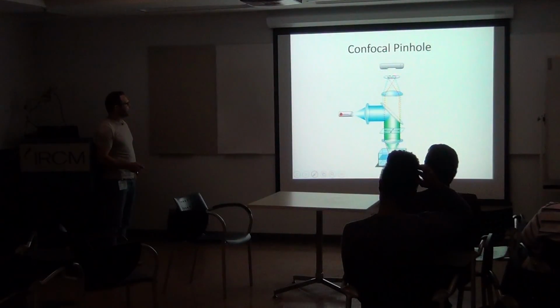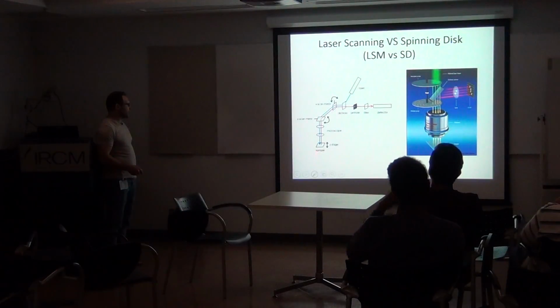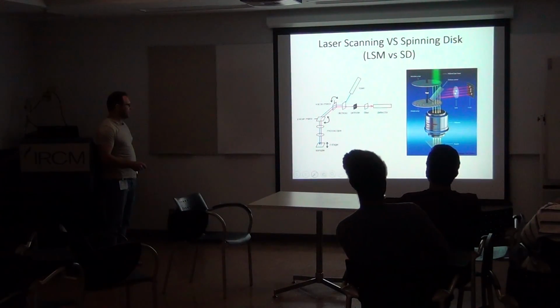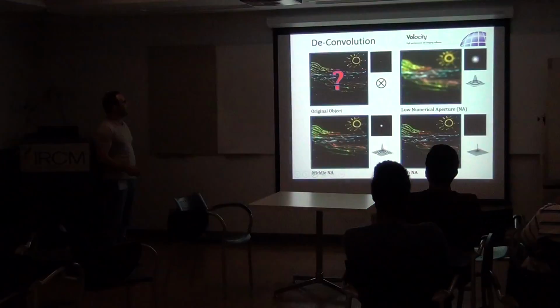That's okay, the confocal panel that we already talked about. Maybe something that pictures it a bit better. So you have an X scanner and a Y scanner, those things turn and make the vibration, so you can scan your specimen.